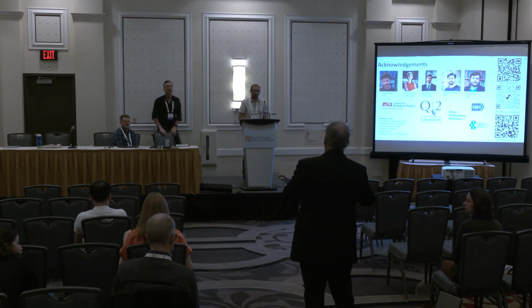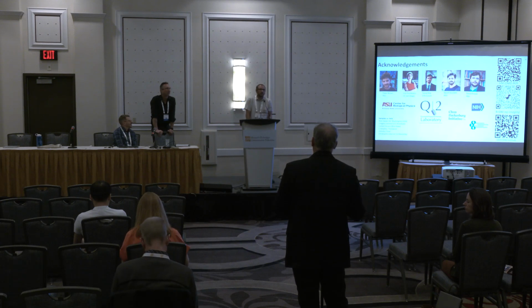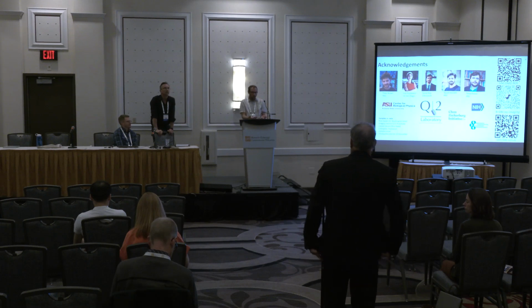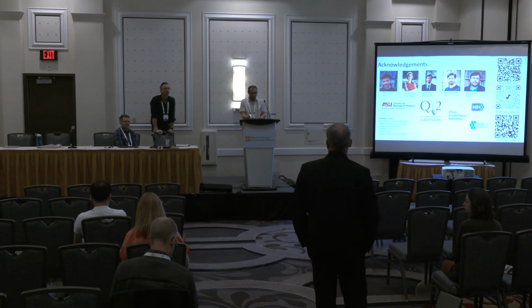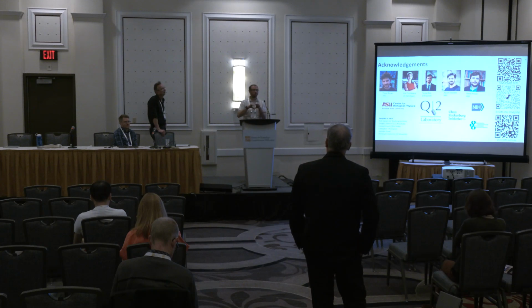So, I understand it's iterative. How are you constraining it? Are you looking at residuals so that it doesn't run completely off the rails? It's the full likelihood. What we have is a model, right? When we run the model, we ask how likely is the model to produce the data that we observed. And then the prior there, which is the constraint, is a prior over the noise.